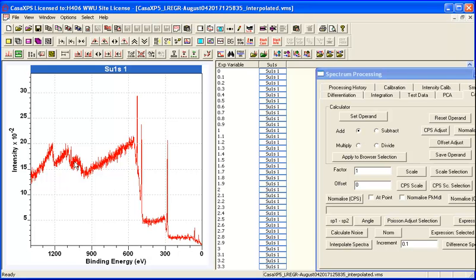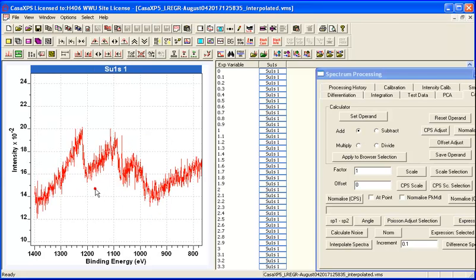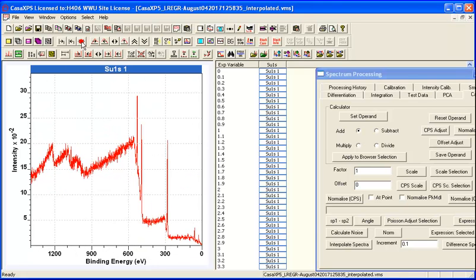So it's not surprising that I can get rid of this sodium 1s while still maintaining a sodium peak up here. This is now becoming less chemically meaningful and more of an abstract type vector, but nevertheless it's the kind of information that's required to reproduce that first spectrum.